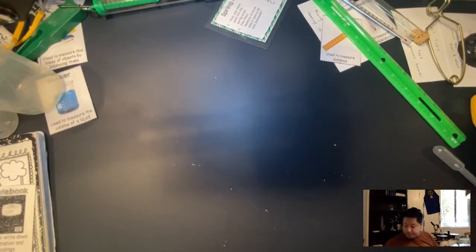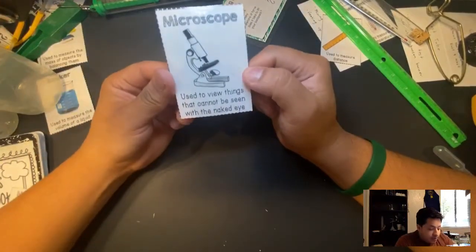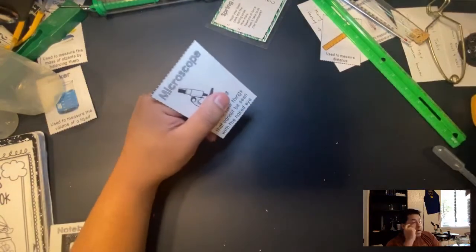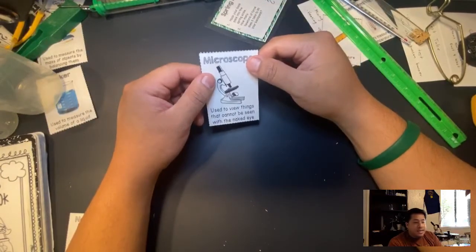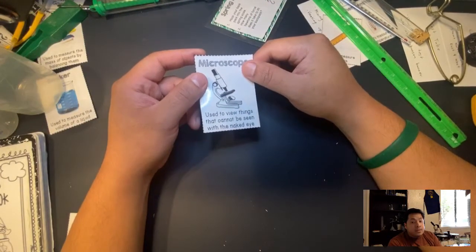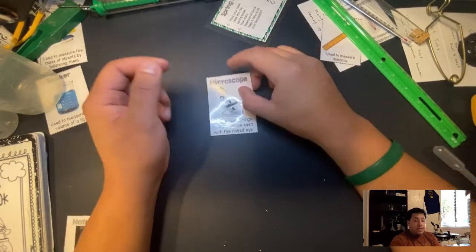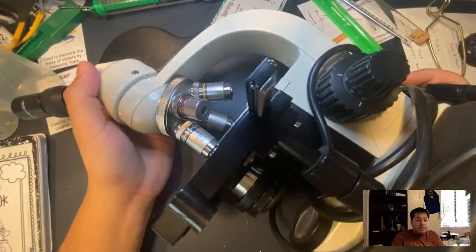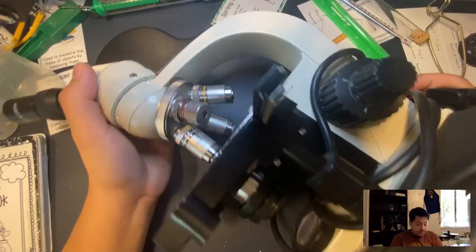Next — a microscope, used to view things that cannot be seen with the naked eye. Some things you can see with your eye, but microscopic things you cannot, so you must use a microscope. I actually have one here — it's really big and heavy. It's an electrical one that I can connect to my laptop.